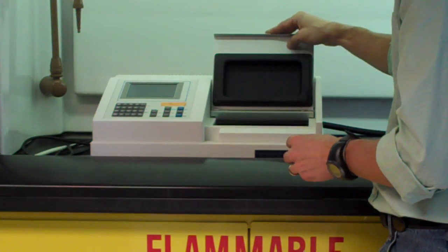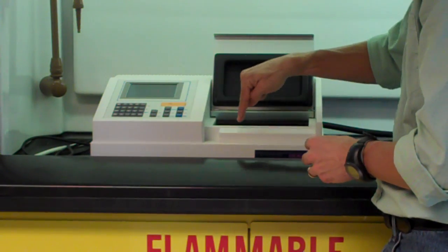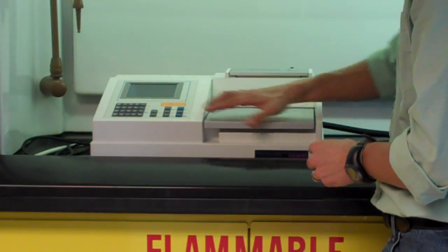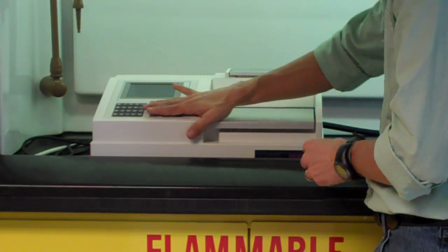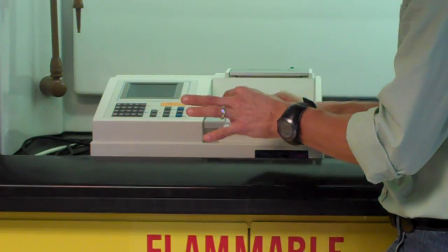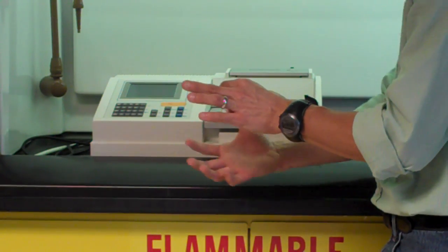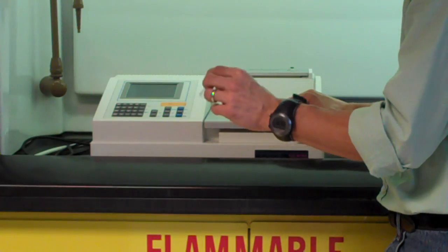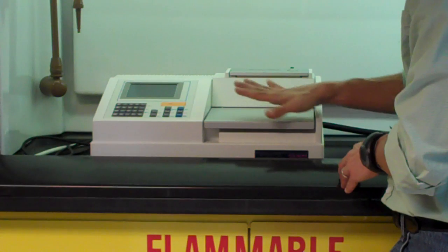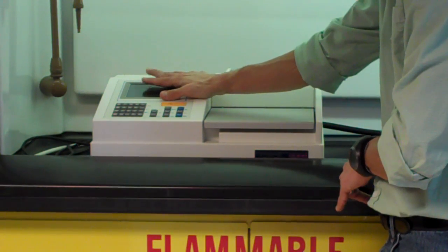The cuvettes are placed on the inside here. There's a small chamber. The beam runs front to back in these spectrometers. These are controlled by the keypads over here. The instructions are all in your lab. And so you would take a cuvette. We normally wipe the cuvette free of fingerprints because our fingerprints contain oils and grease that would absorb some light. Put the cuvette into the holder, close the lid, and we'll simply get our readings off of the screen.